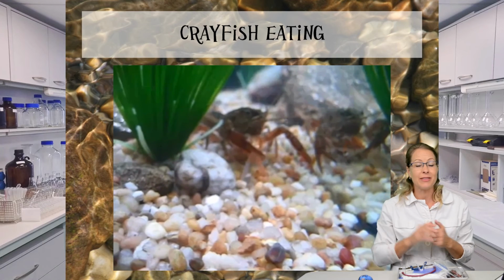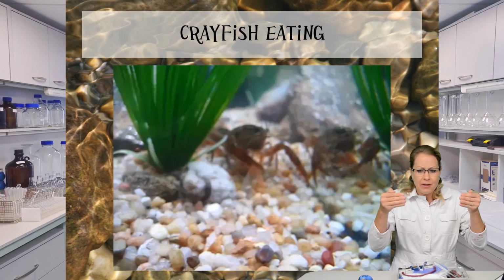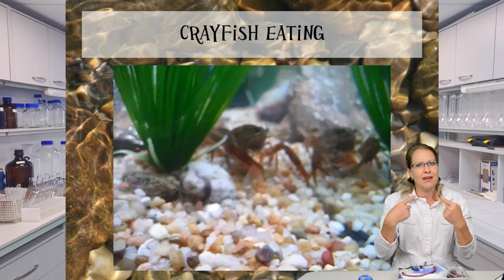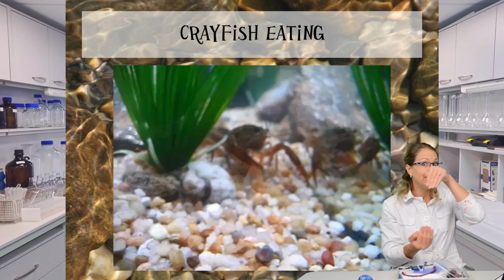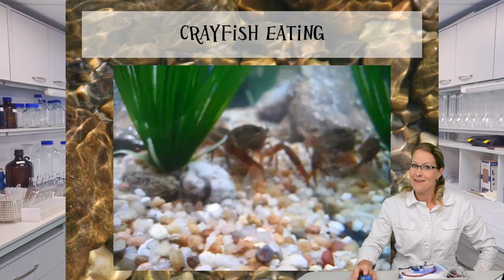Yeah. So another thing that's cool about the crayfish is that he eats this way. He has two teeth that go chomp, chomp, chomp, which, if you think about it, is different than us. Which direction do we chew? We chew up and down like this. He chews sideways. Very cool.